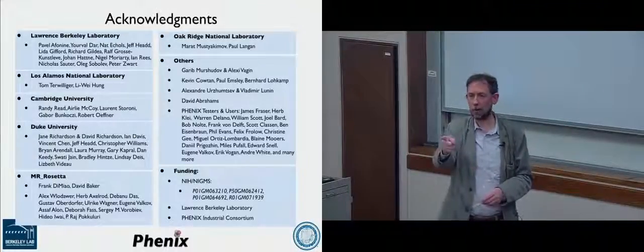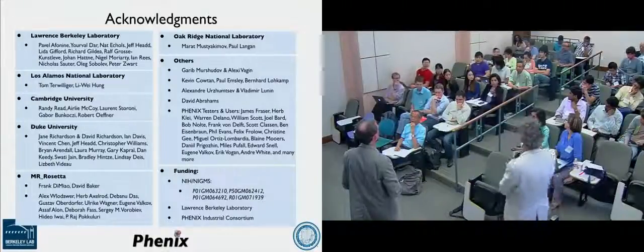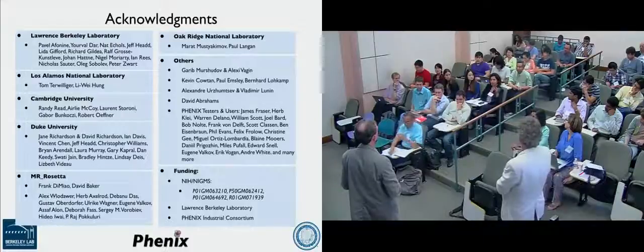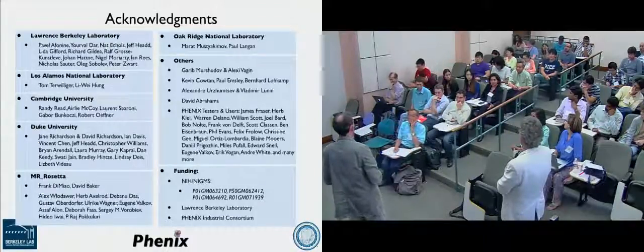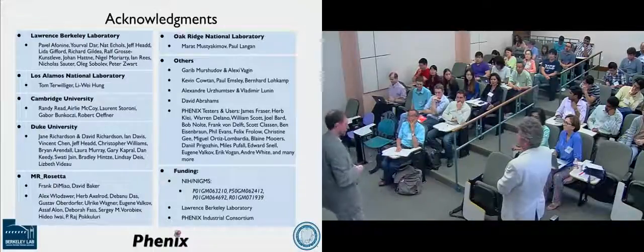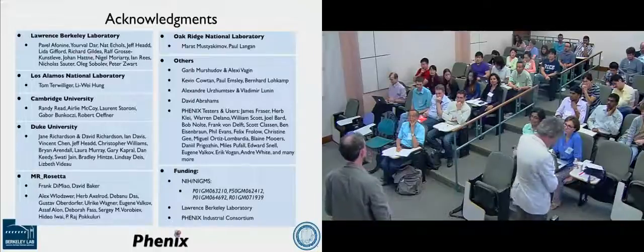Yeah. So there was a question here. I was just wondering, when you deposit structures solved using molecular replacement, are you supposed to put in all of these statistics, correlation coefficients, and do you submit that to the PDB? I've never seen it in a publication. No, it's a very good question, actually. So you're not asked to do that.